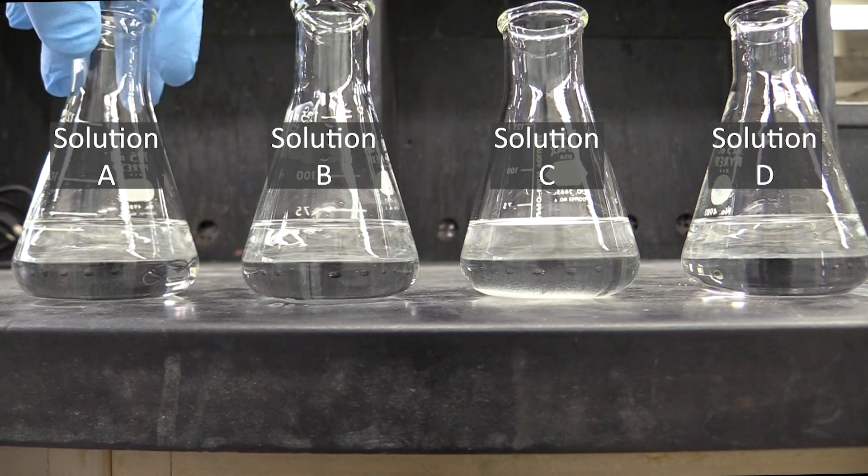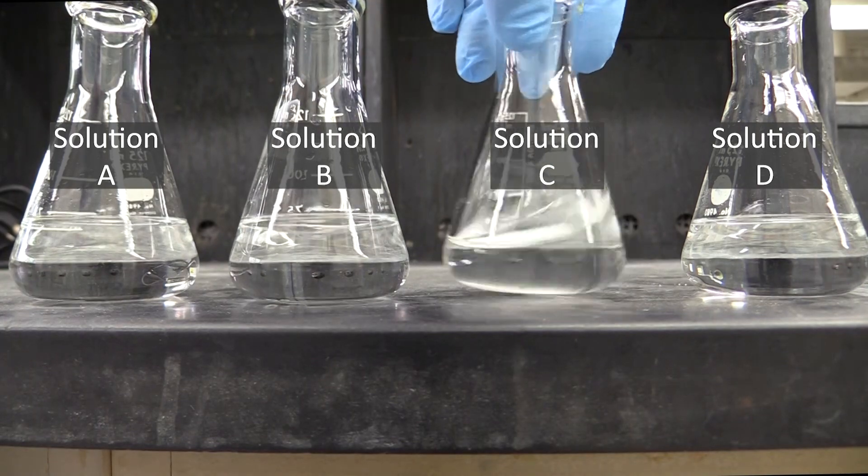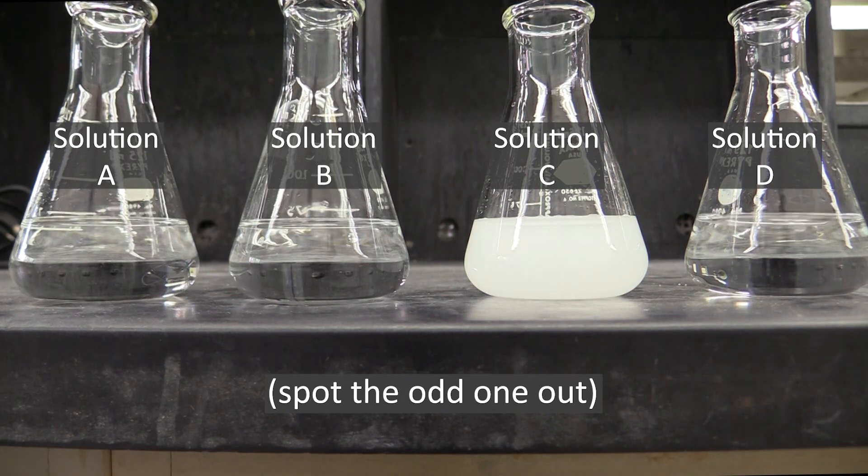Of all the various solutions you will be given, most will be soluble, but one or two of them might not. Your first task in this experiment will be to use your powers of observation to tell the soluble ones from the not-soluble ones.